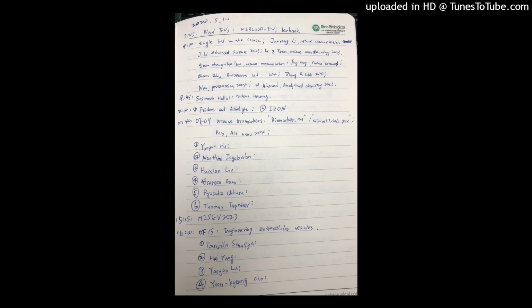So now we can calibrate flow cytometers, we can generate absolute concentration of vesicles. For the first time, we can compare the concentrations of certain vesicles between instruments. And what we now did, we collected blood from, I don't know, 200-300 healthy individuals, and we have determined a reference range of vesicles that we also added to the manuscript.